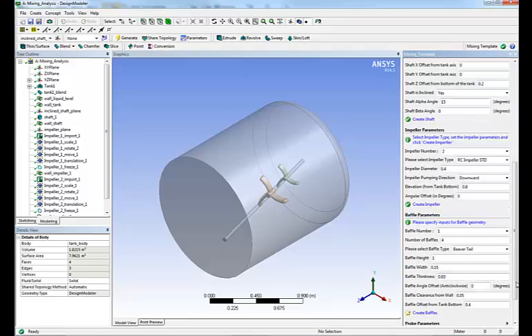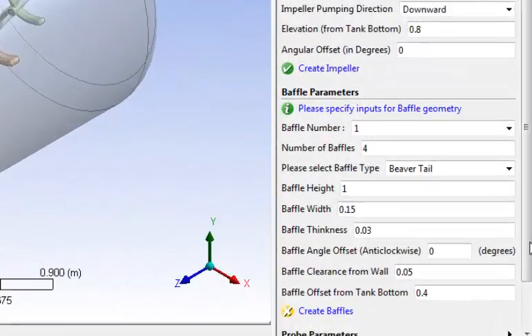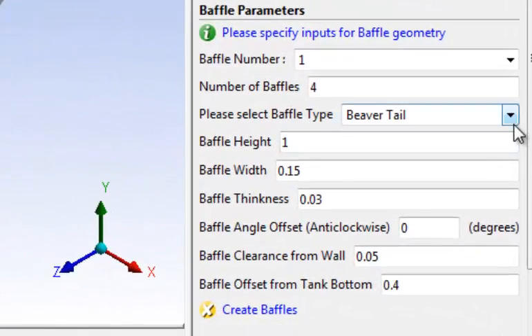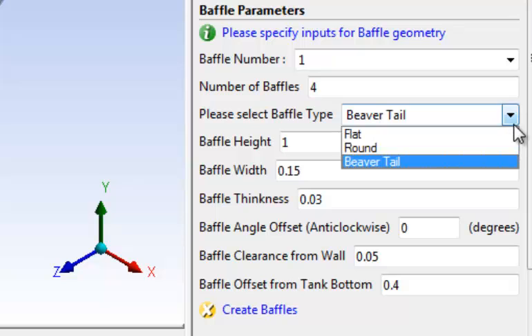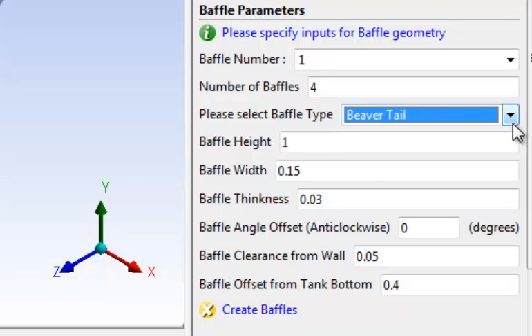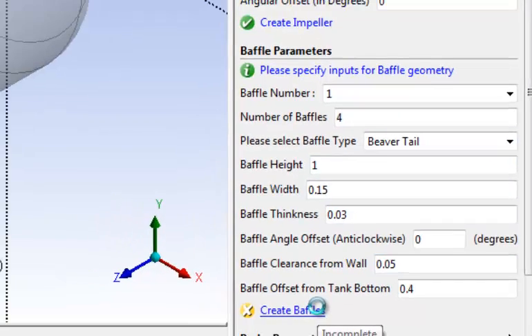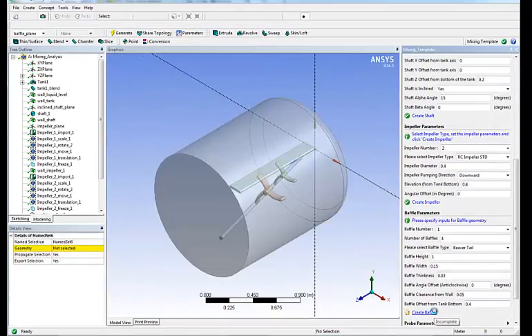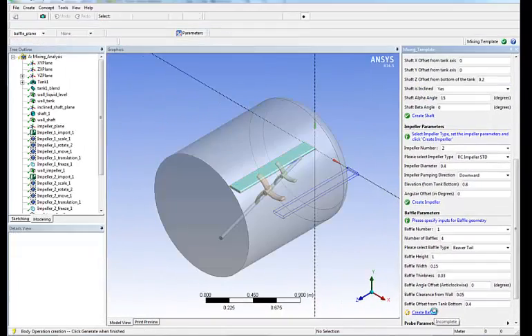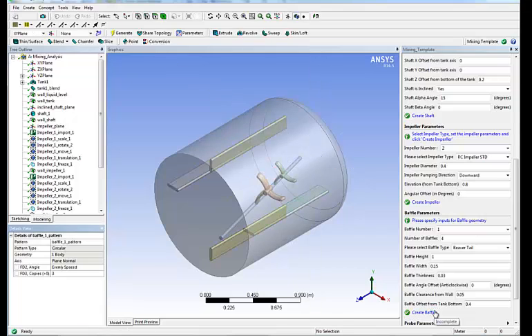Next step is to define the baffles. Here we're going to have beaver tail baffles. We're going to have four of them. Same thing, we enter some key dimensions and simply click create baffles. Here are our four baffles.